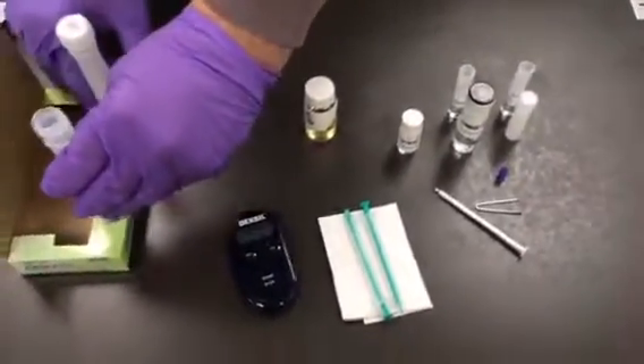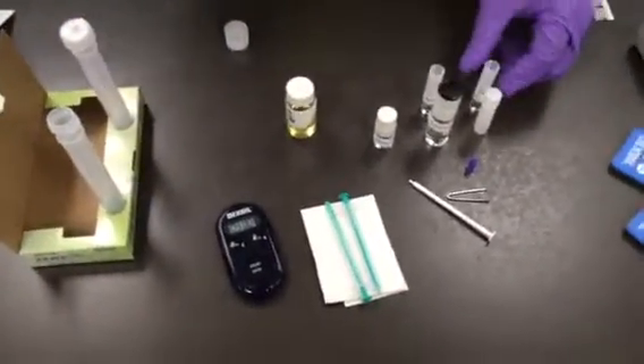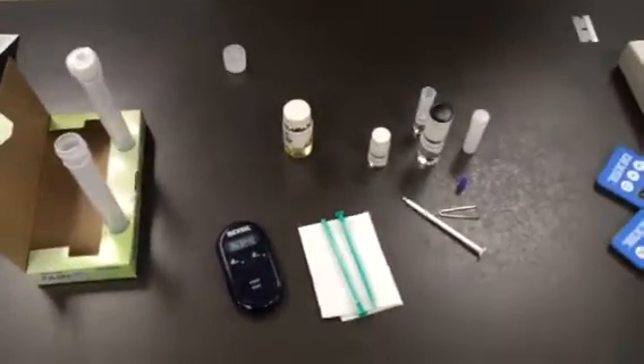This is our unofficial FameCheck instruction video. We're going to break it into three small clips: reaction, extraction, and titration.